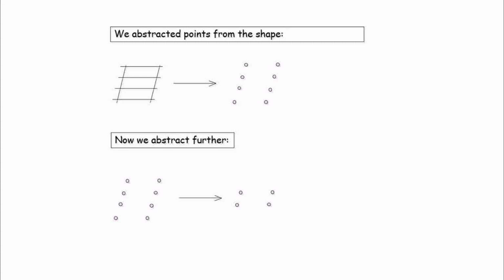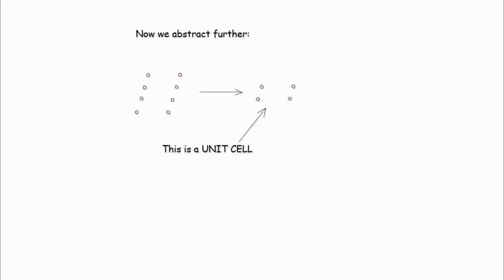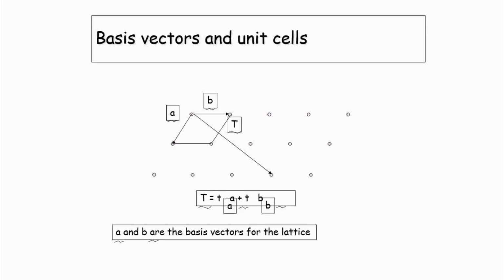Taking that similar idea, if I have a small lattice, it is easy for me to manage. It is easy to study how the X-ray diffraction behaves once it passes onto this lattice plane, and then I can repeat the same for other planes also. Then I can understand the entire behavior of my crystal, right? So this unit cell is very important.